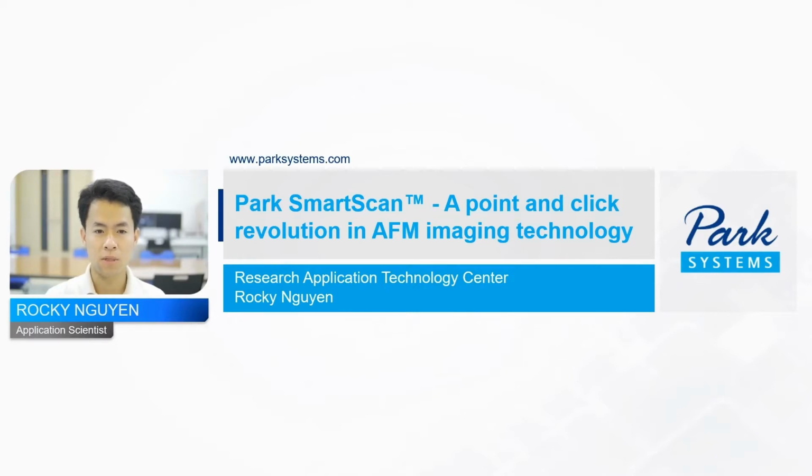Throughout the previous webinar sessions, we have introduced you to different AFM techniques, from the very basics to the advanced measurement modes. On the other hand, to properly communicate with the AFM system and collect high quality data, the AFM operating software is also very important. So in this webinar, I will be talking about the Park SmartScan AFM operation software, a simple point-and-click control for the AFM measurement.